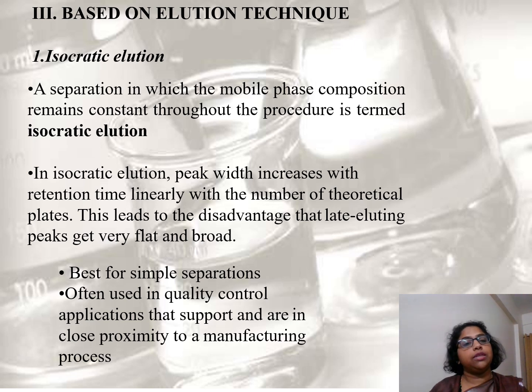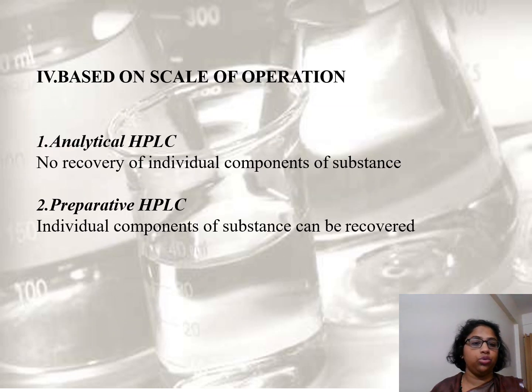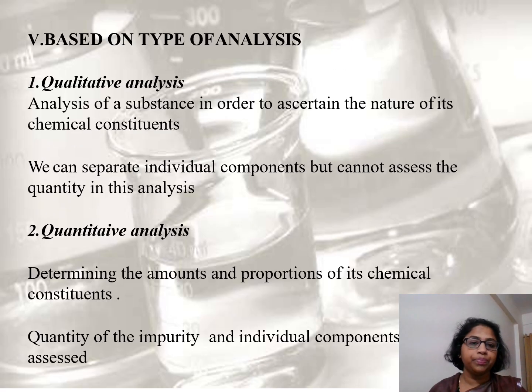HPLC can also be classified based on the elution technique: isocratic elution and gradient elution. And we have analytical HPLC and preparative HPLC. In analytical HPLC, we can only do an analysis of the components, whereas in preparative HPLC, we can recover the substances.